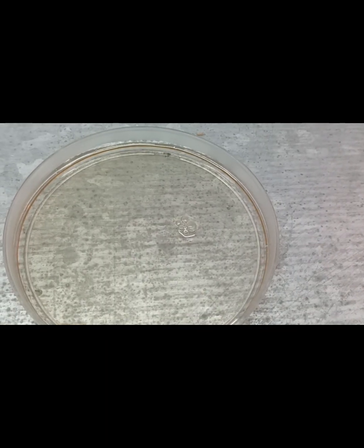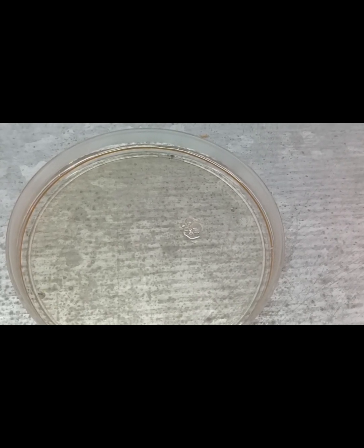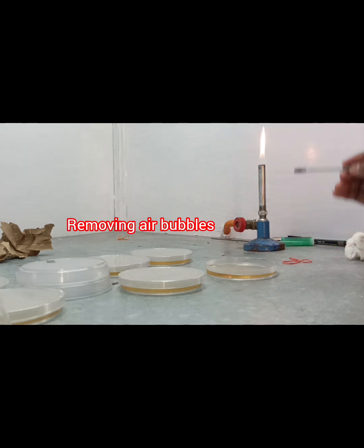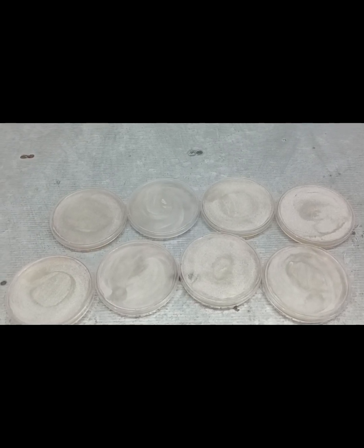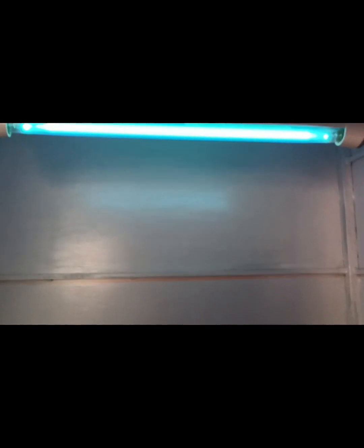Here we can see that one bubble is formed at the time of pouring the MHA agar. At that time, we have to red-heat the nichrome loop and touch the bubble to clear it. After completing the pouring of MHA agar, we allow it to cool.